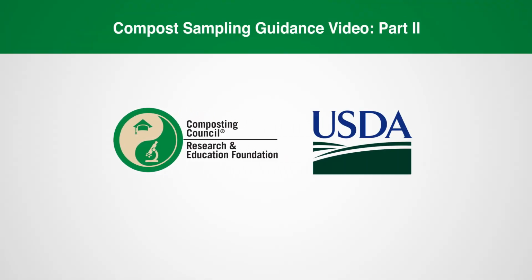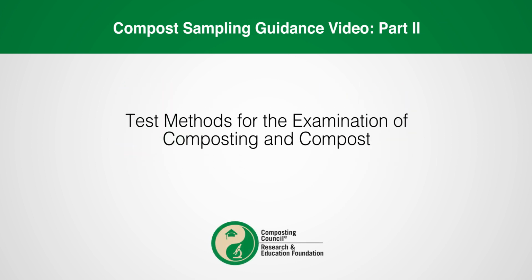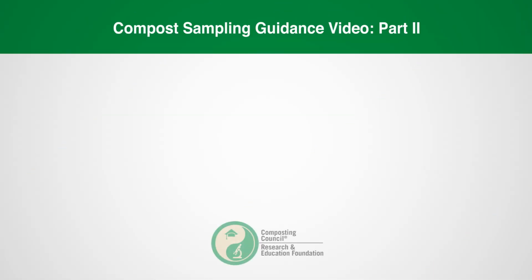Welcome to part 2 of the CCREF's, or Composting Council Research and Education Foundation's, Compost Sampling Guidance video series. The CCREF, along with the USDA, has developed methods through the development of the Test Methods for the Examination of Composting and Compost, or TMECC, publications. The following items will be covered over the course of this video.